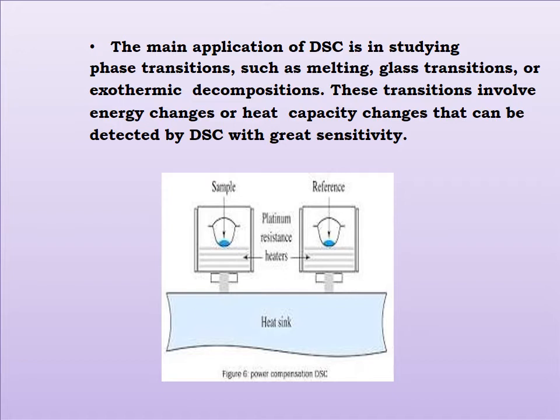And this is mainly used for phase transitions, especially melting and glass transition, and also for exothermic decomposition studies. And this transition occurs because of the heat capacity, the heat differences which are being applied to the sample.